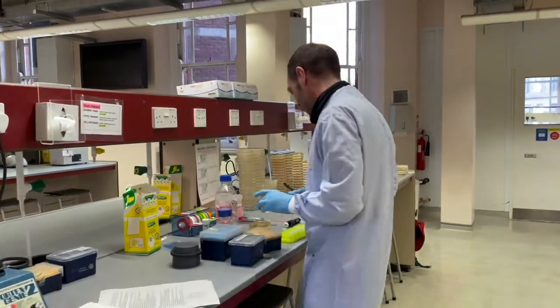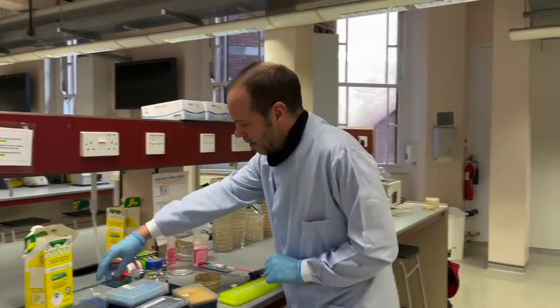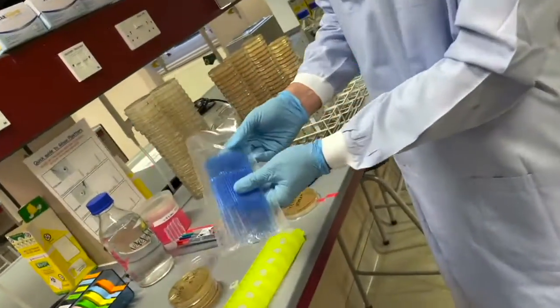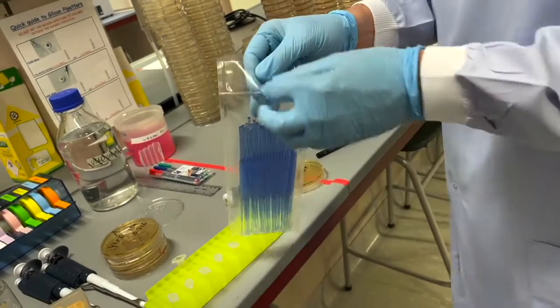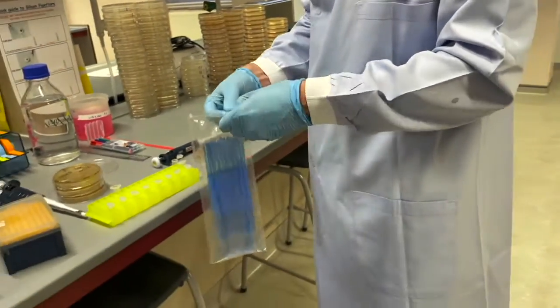Good, so we don't need any beads because we're going to use sterile sticks. Again, these come in different forms, but the ones we've got in the lab here come in a completely sterile sealed bag. I'm going to have to work out how to open it. I might as well just do that now. Let's see if I can peel it. Yes, peeling works well, which is good.